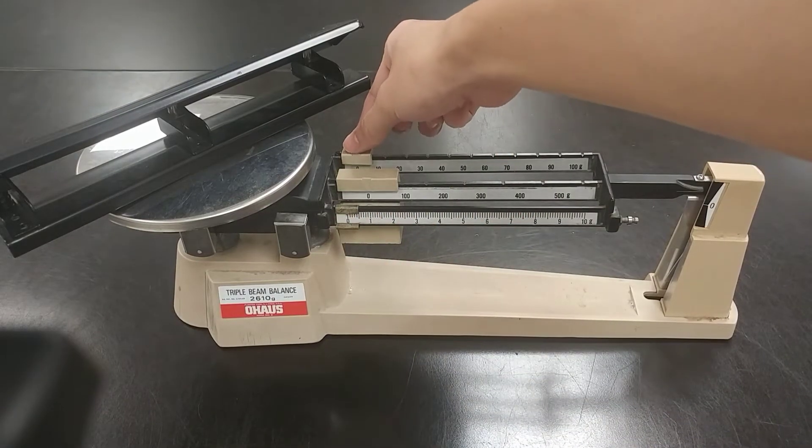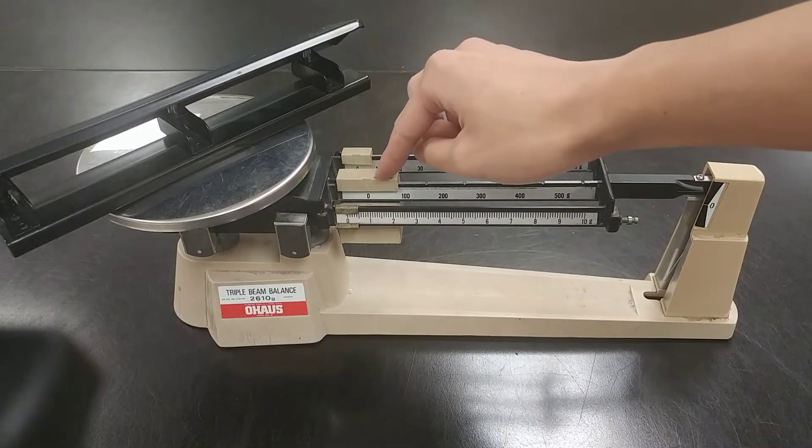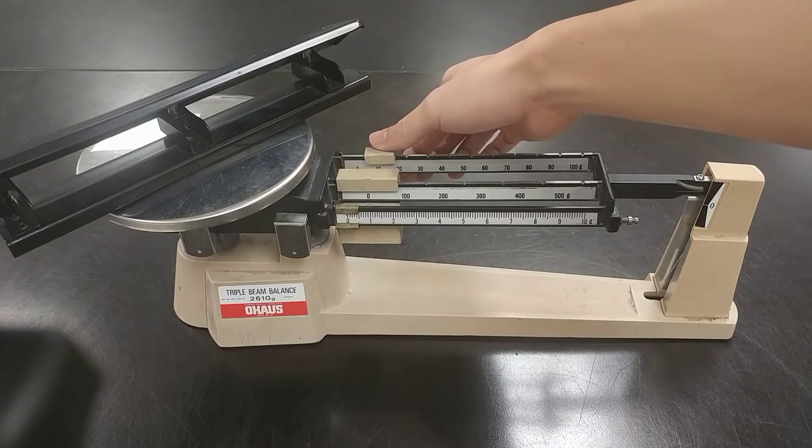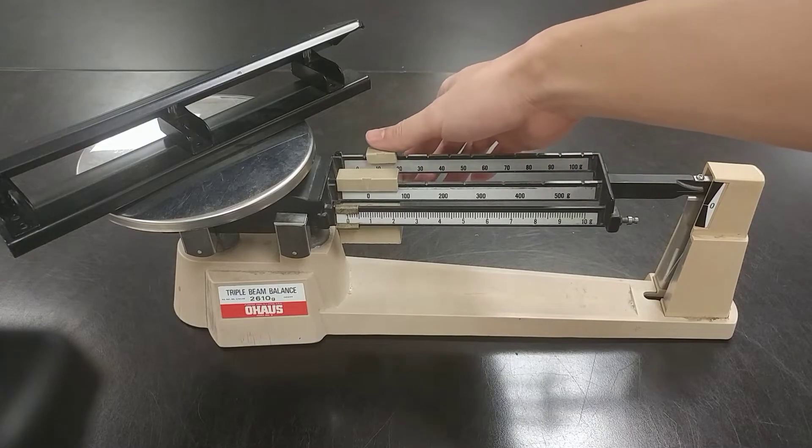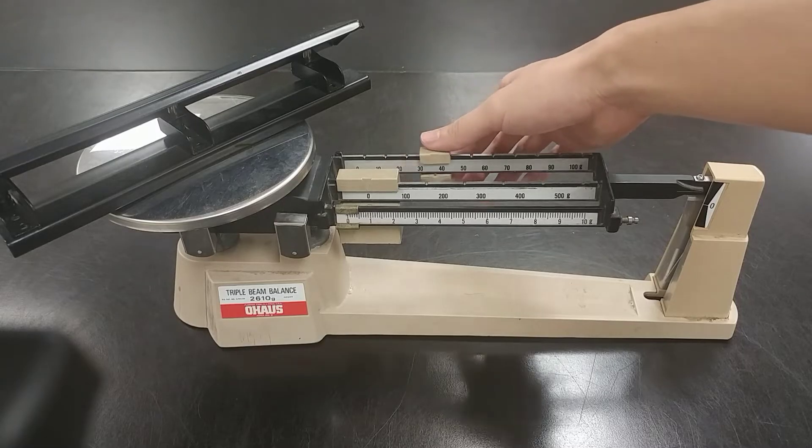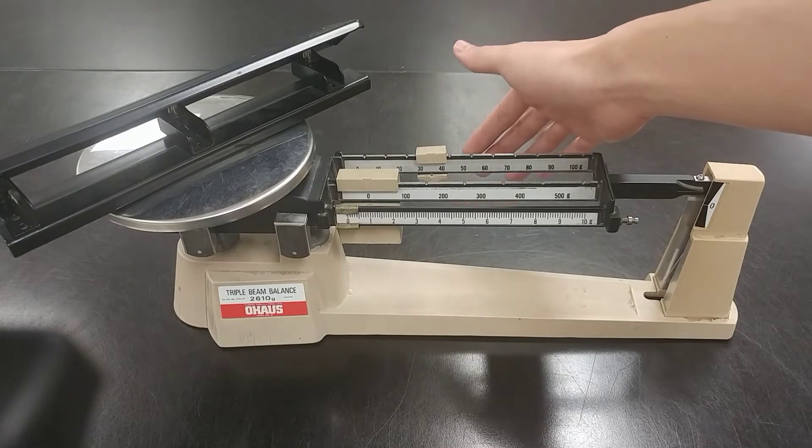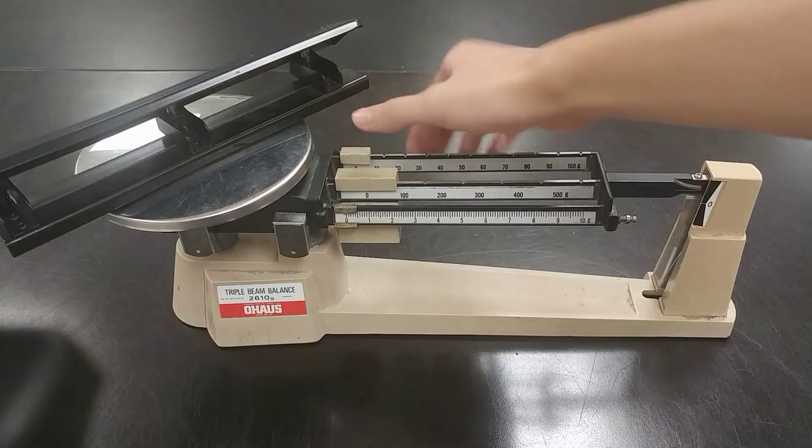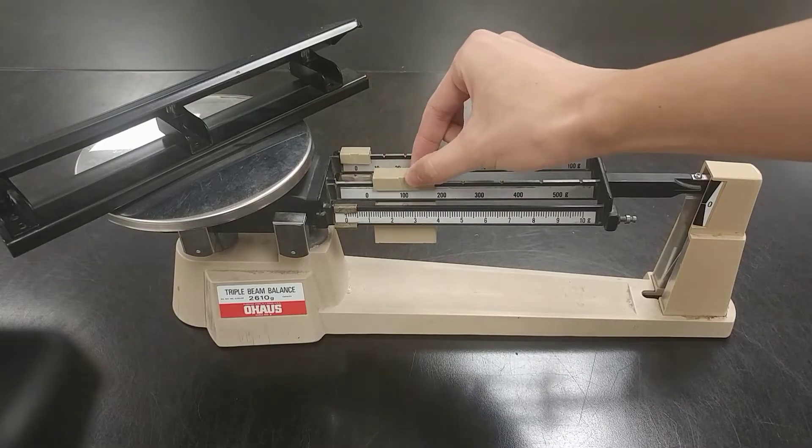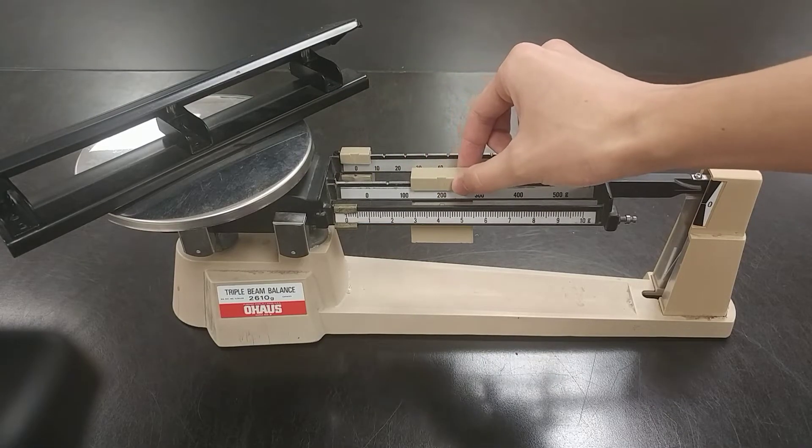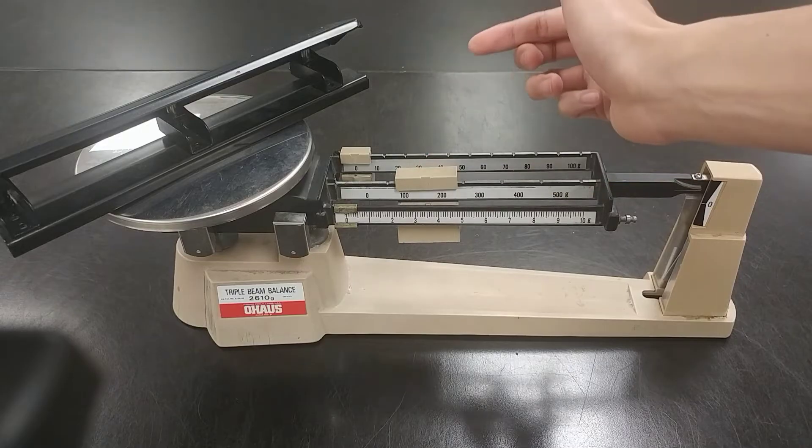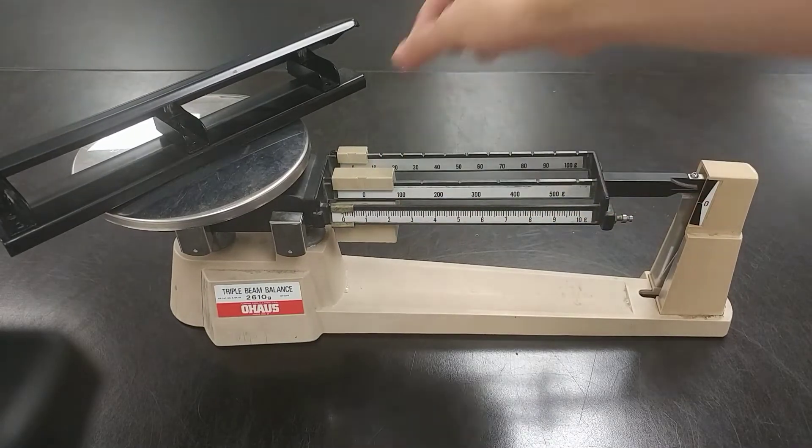Now we're going to try the medium one. Both the medium and the big one must be exactly on the number. For example, the medium has to be on 10, 20, 30, or 40—it can't be anything in between. The same with the big one: it can either be on zero, 100, or 200. It can't be in between because there's no number there.